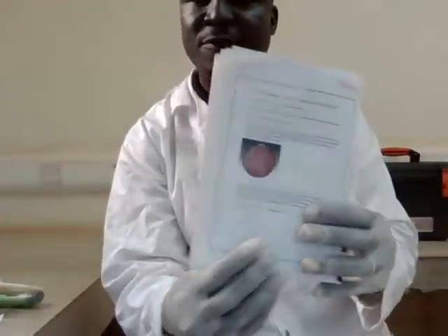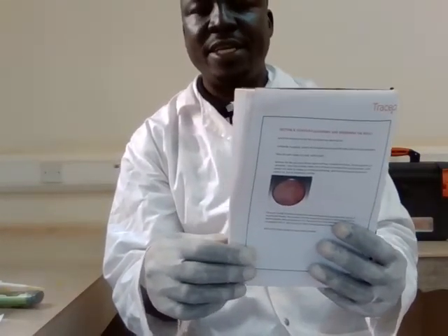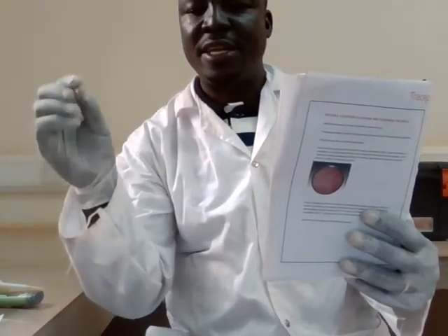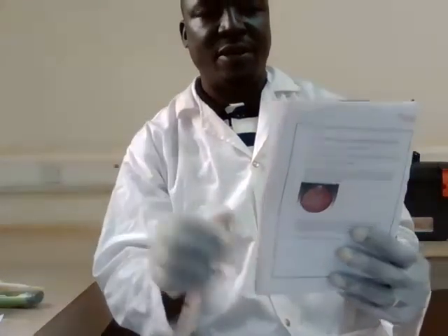So whatever you count from here is in that volume that you put. So if you put less than 100 ml, you have to calculate and report in a standard way, the number of colony forming units per 100 milliliters of the specimen. So you need to learn how to do that calculation.